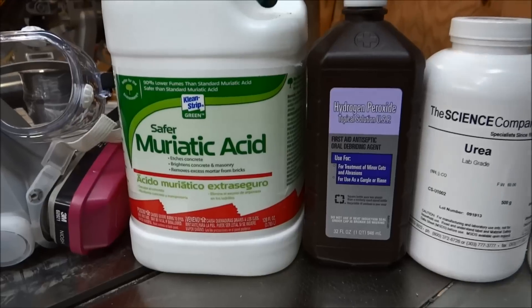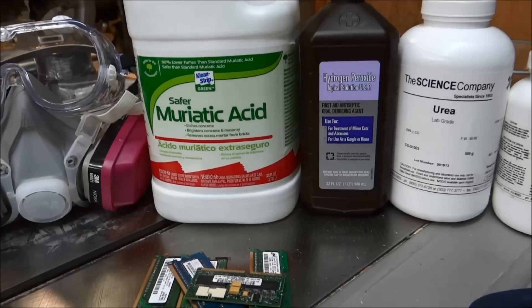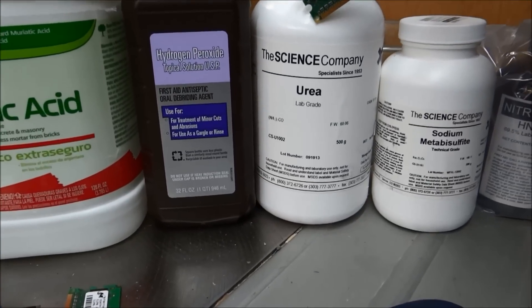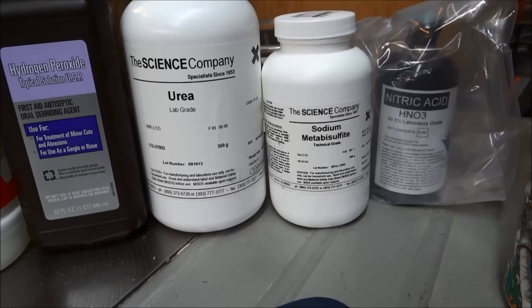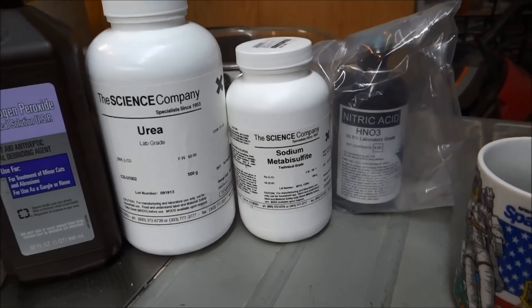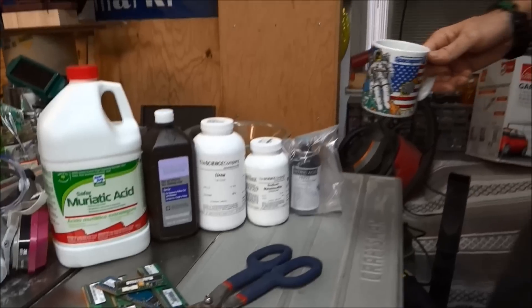We're going to need muriatic acid and hydrogen peroxide — both came from Walmart, so you can get those readily. That's for the first step. For the next step we're going to need some urea, which I got from the science company, and some sodium metabisulfite. Then there's nitric acid, which obviously scares me given the container it came in. And this is my NASA cup — in honor of the astronauts walking in space yesterday and saving the space station. Go USA astronauts, you rock!